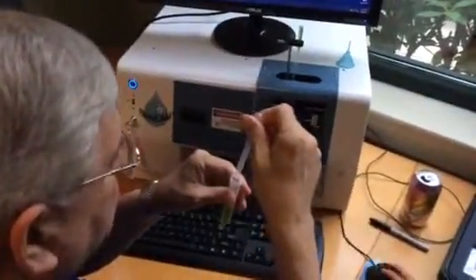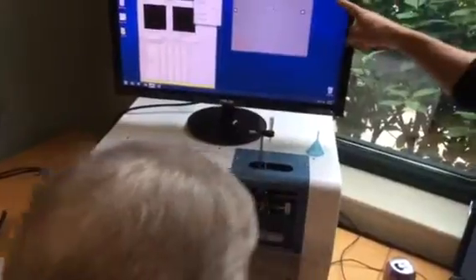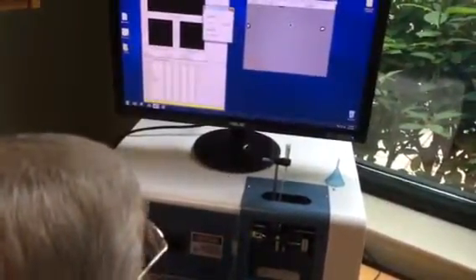Good. Great. So now we're going to start the pump and begin to bring the sample down. As soon as you see it come into the field of view, you can just hit the X there and close that whole screen. It'll stop the whole function at the same time. So go ahead and start the pump and navigate over to the X, so that we're ready when it comes. So as soon as we see it, I'll just hit this.